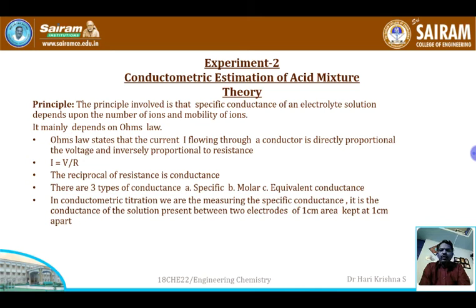The entire experiment depends upon the Ohm's law. So what does Ohm's law state? The Ohm's law states that the current flowing through a conductor is directly proportional to voltage and inversely proportional to resistance. So this is the main principle behind your conductometric estimation.